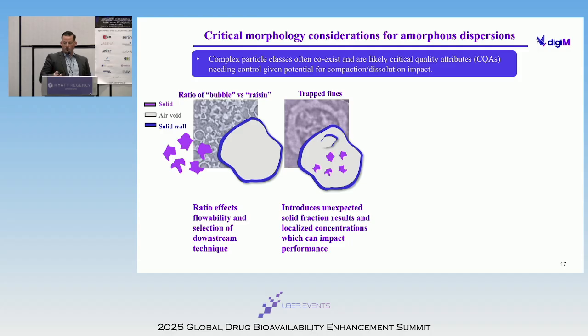But then this was one of the particle classes I alluded to before. We've seen this arise a lot with aggressive post-drying, where we'll see these hollow particles, some people even call them pregnant particles, where they're filled with entrapped fines. In a 2D image, sometimes you'll even see these naturally broken in an SEM image, and you won't know exactly how they got there. But in 3D, you can digitally slice through this, and in every case I've seen, you can always find a hole large enough somewhere that these particles can get in through. So essentially in the aggressive post-drying, it breaks a small hole, and then these fines can get inside.